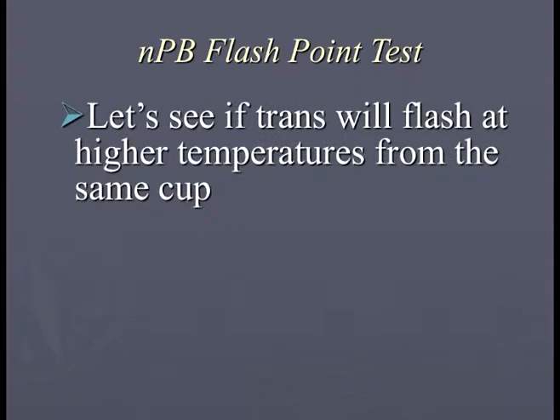Now that we've seen trans flash, let's see if we can get it to flash multiple times at elevated temperatures above the original flashpoint. Let's see what happens. Minus 5.